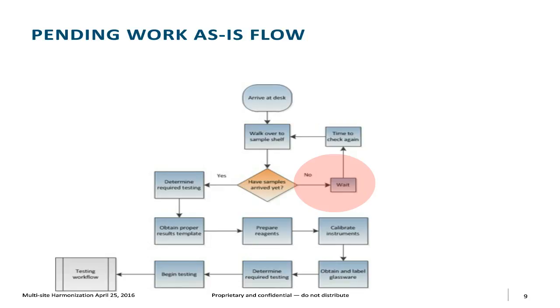Anytime you're waiting around, you're not getting push notifications of work to do. And by the way, this could apply to supervisory workflow. We could look into workflows where work has been done and results have been generated. In a paper world or a semi-automated world, result reports may be piling up in the inbox of a supervisor. And a supervisor knows that they have work to review when they look at their inbox and see a pile of work to do.